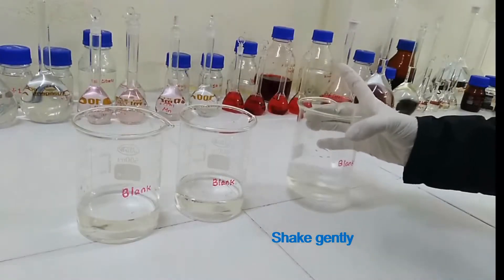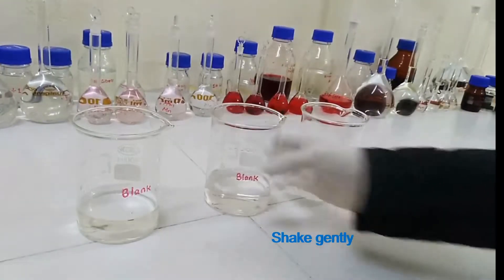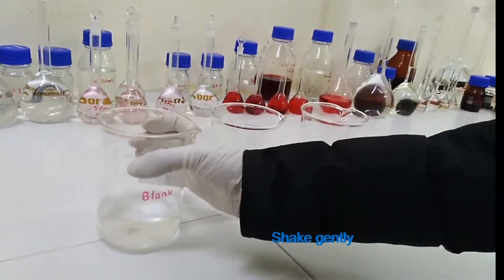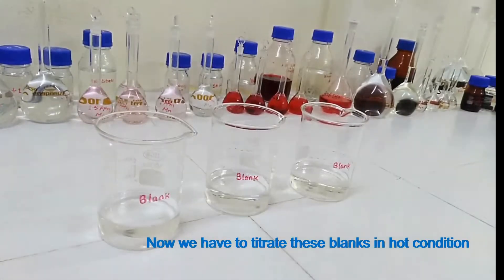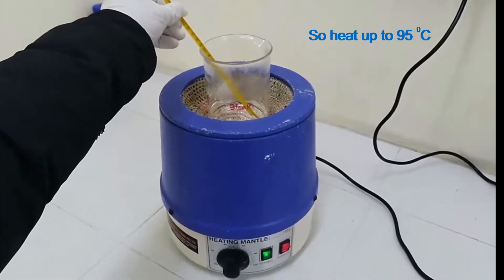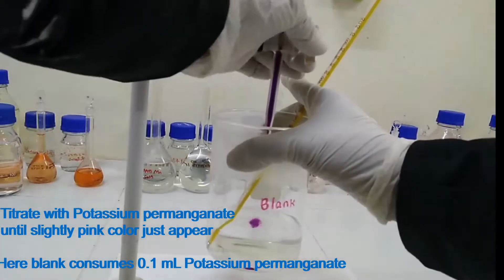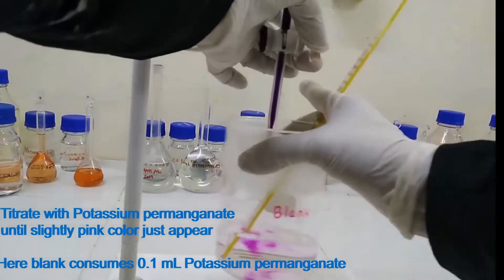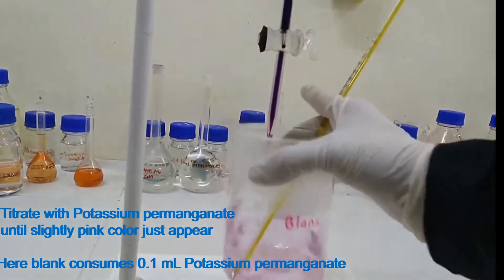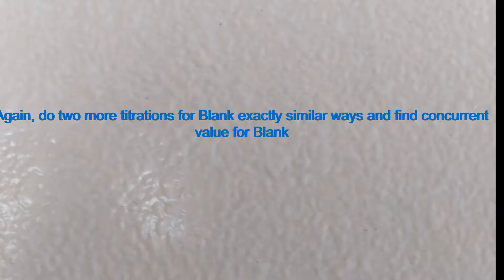Shake gently. Now we have to titrate these blanks in hot condition. Heat up to 95 degrees Celsius and titrate with potassium permanganate solution until a slightly pink color just appears. Here the blank consumes 0.1 ml potassium permanganate solution. Do two more titrations for the blank in exactly the same way and find out a concordant value for the blank.